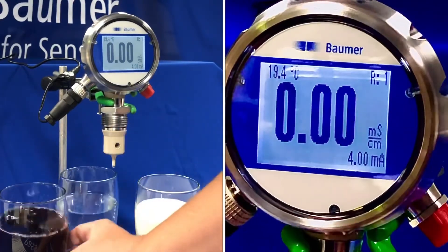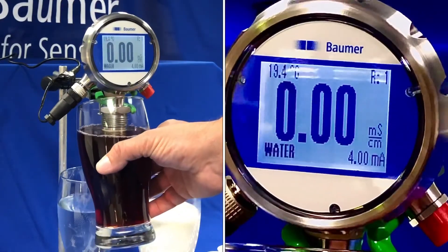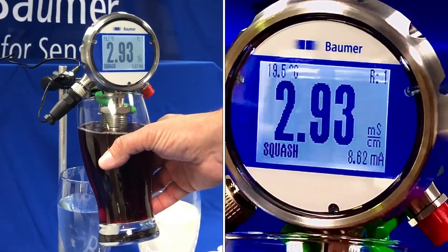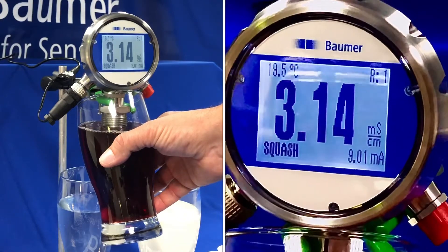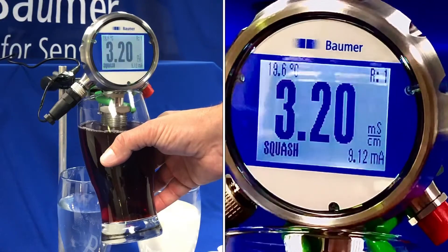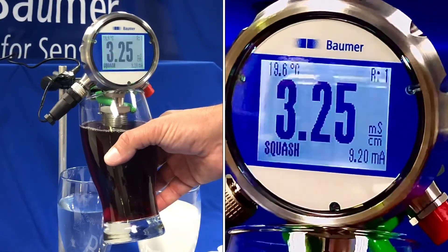If I change the media to squash, we've now got squash in the bottom left-hand corner and we've changed the milliamp reading to around about 8 milliamps. When it's settled, you can also see I've organised a green flashing display when we've got squash in there.